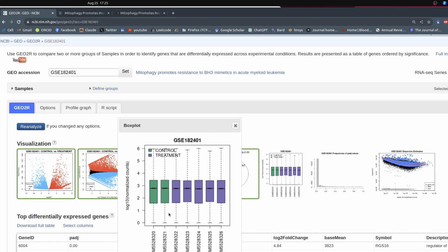So in the control group, the gene expression and the treatment group gene expression is a little bit different, which is probably expected. And this central tendency gives us a better view on sample to sample and control versus treatment genes' normalized count.